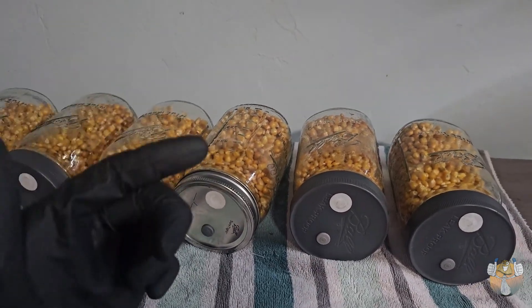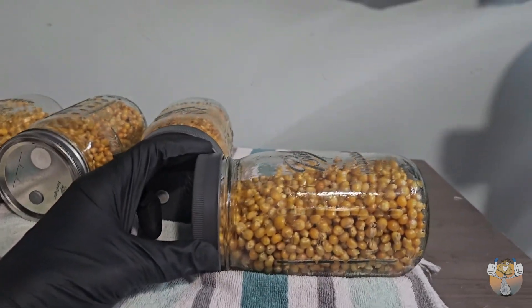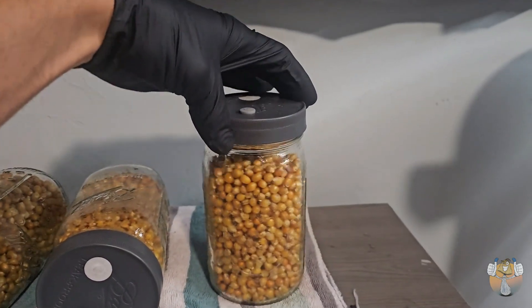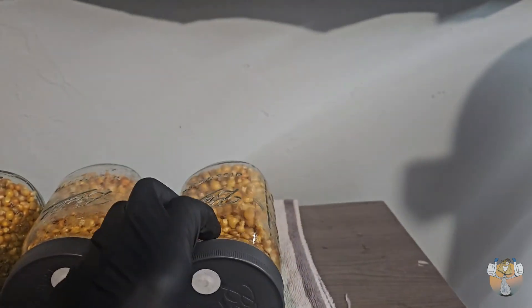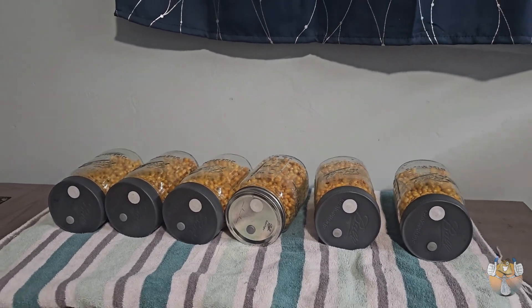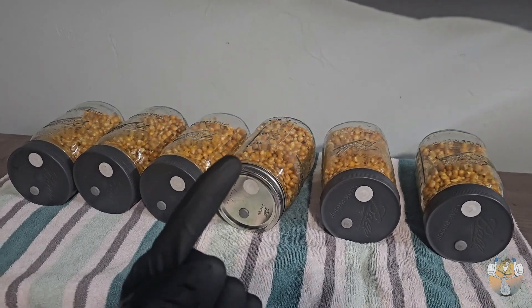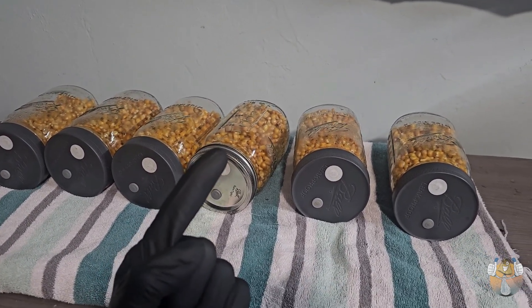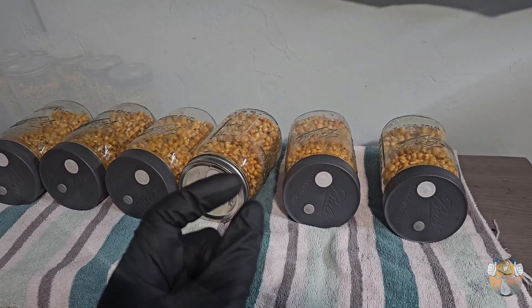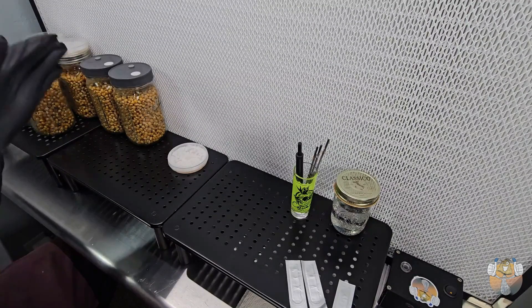Once we have our popcorn out, I like to lay the jars flat on their sides and let the popcorn lay out evenly so that we have more surface area for evaporation. If we have them stacked upright, only the top will get proper evaporation and the rest of the grains will stay moist. So lay them sideways, place them on the towel with filters up, and every day or so we'll give them a shake and lay them right back on the side with the filters up.